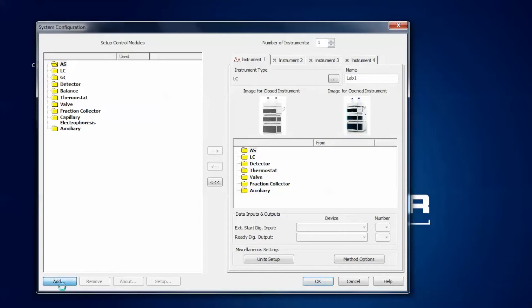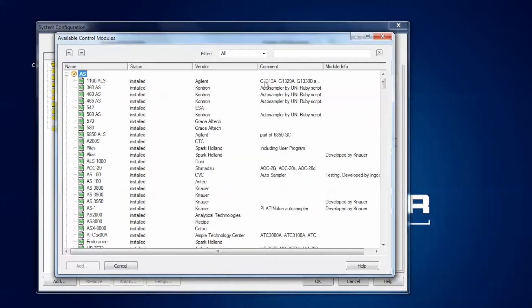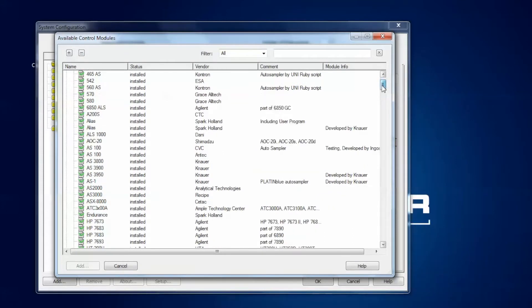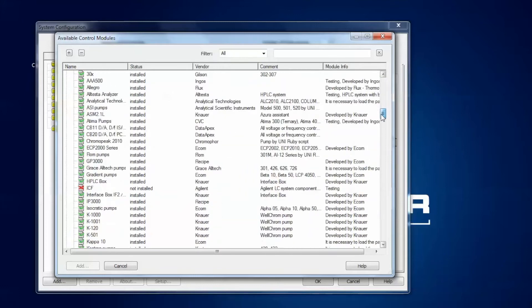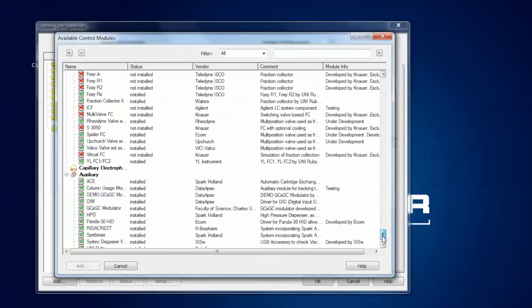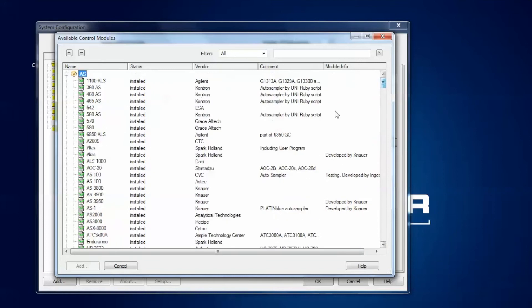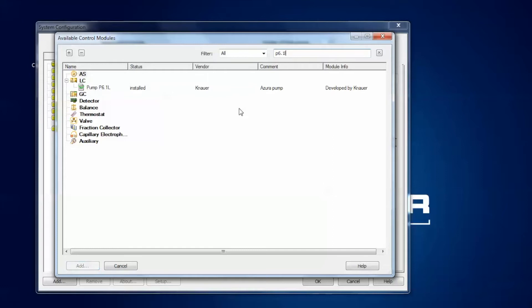To add a new device you can just click the add button here on the left corner. A new window will open that shows you a list of all available modules supported by the software. Since the list is very long and it can be quite tedious to scroll through it, I recommend typing the device name into this window. In my case I will start with the P6.1L and you see the list shrinks down to just one entry.